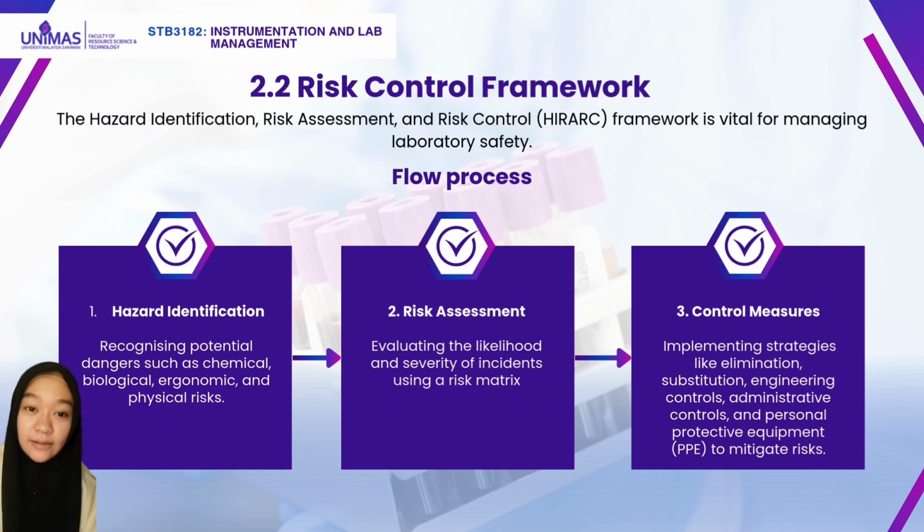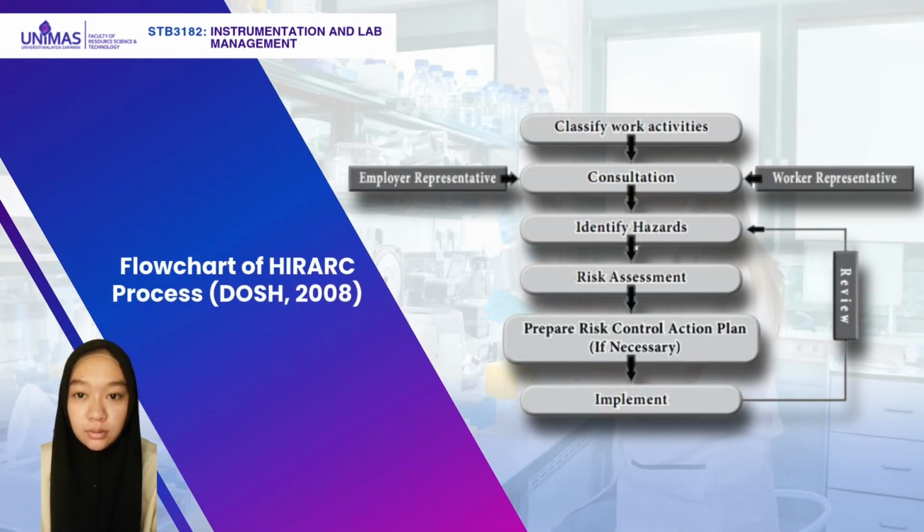In summary, effectively managing risks in laboratory settings is essential for ensuring worker safety. By implementing preventive measures and adhering to the safety protocols, we can create a safer environment for research and also experimentation. This picture shows the flow of the framework.